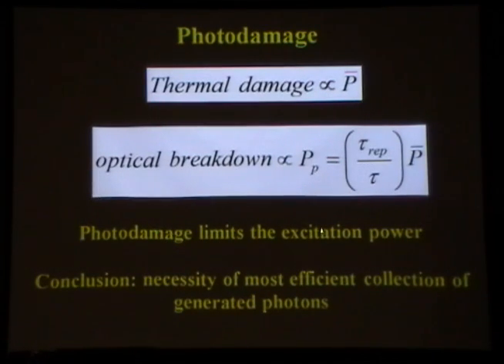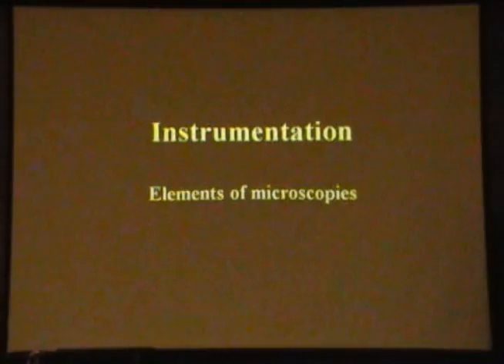That means that if you cannot increase your laser power at the sample as you wish, you will have to be very careful to not lose many generated photons, to collect all of them in the most efficient way, to avoid thermal damage or optical photodamage to your sample.